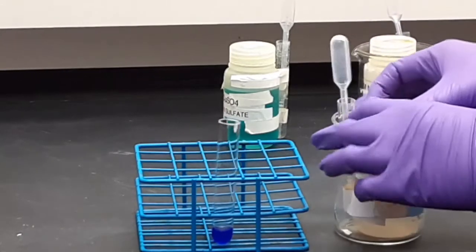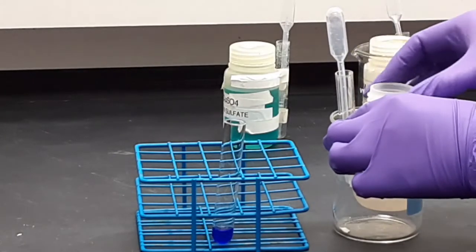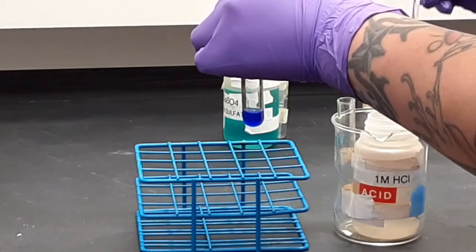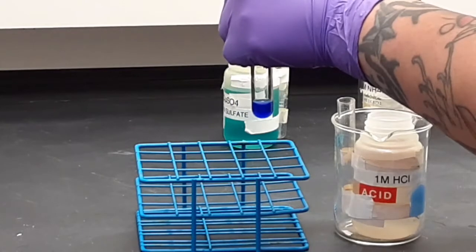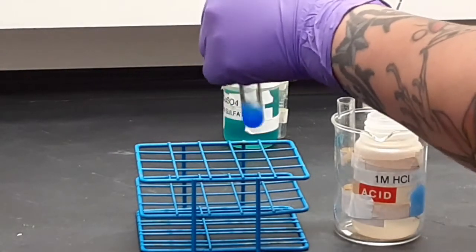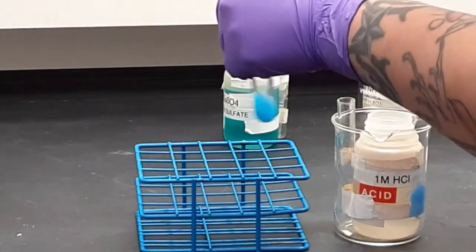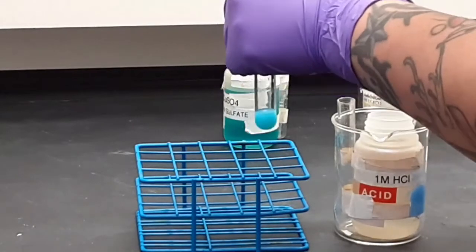One molar hydrochloric acid. Hydrochloric acid is another substance that's very difficult to get an accurate concentration of, and for many of the same reasons. It's usually more accurate than the ammonium hydroxide, however, which isn't even accurate out of a container, being rather marketed in a range of concentration.